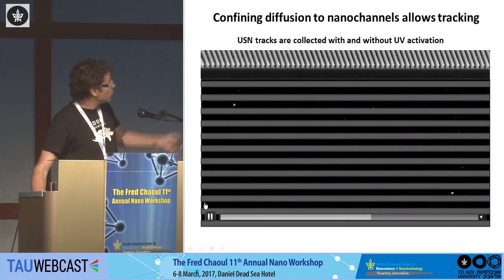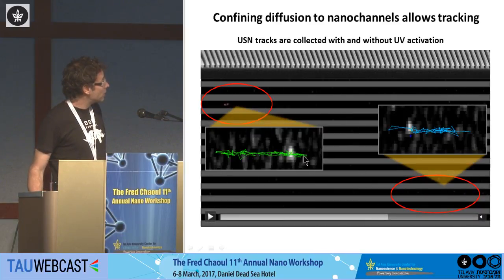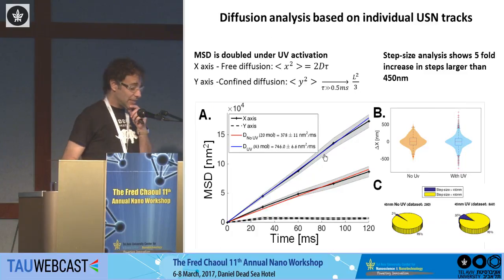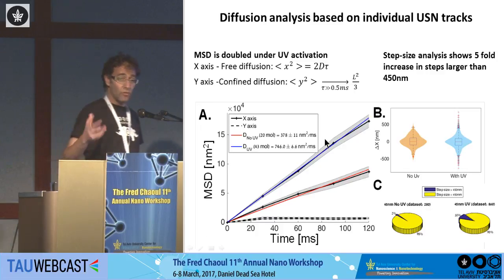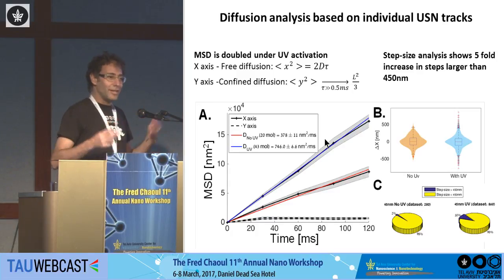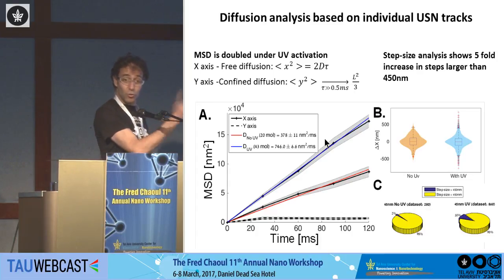And indeed, using these nanochannels, we could get enough contrast and signal to noise to follow these individual molecules and perform what is called single molecule tracking, where we get very detailed trajectories of the movement of these nanosubmarines. The very interesting and maybe expected result is that the diffusion constant jumped up twofold when we shine them with UV light. Of course, we had a lot of controls to see that it's not heating and things like that. So they're faster. They sample more space in a unit of time when you shine them externally with UV and you start rotating this rotor.